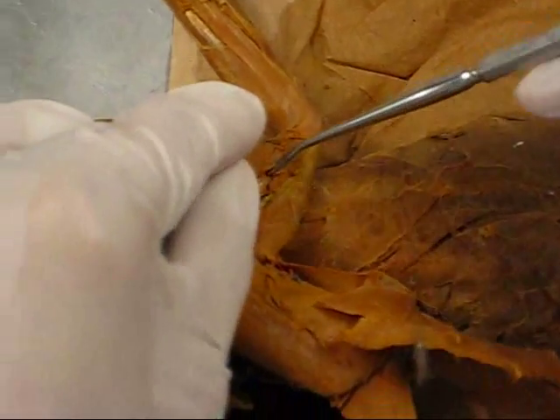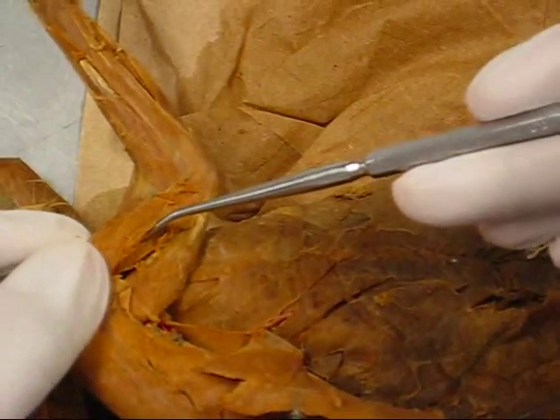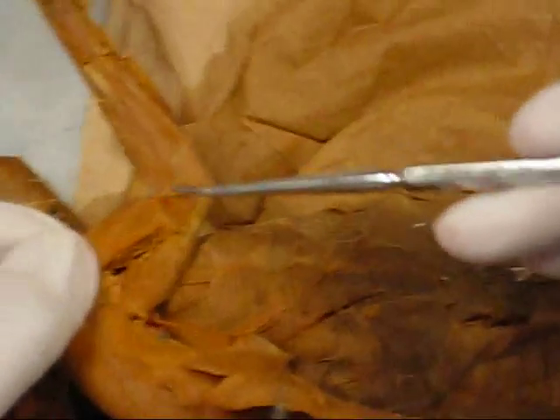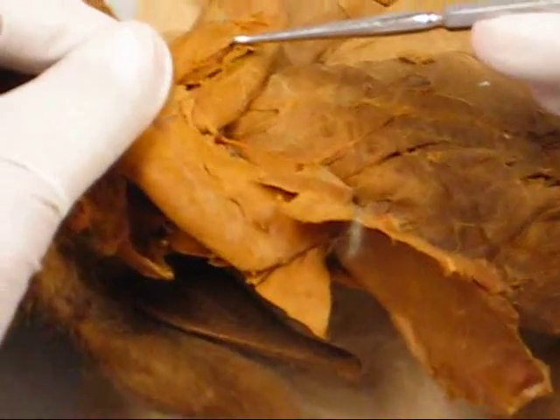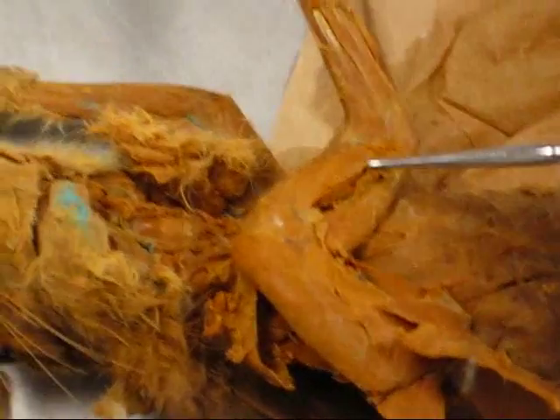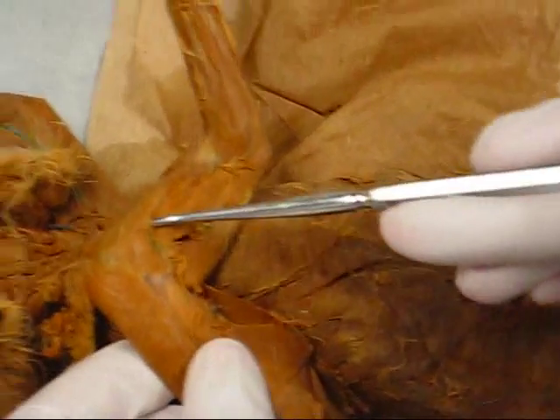And then on the inside is the — what is it called? The medial head of the triceps. Brachioradialis, spinal deltoid.